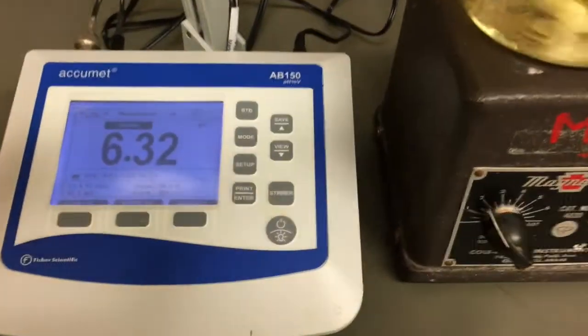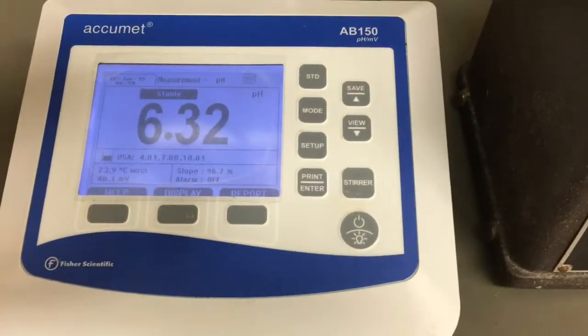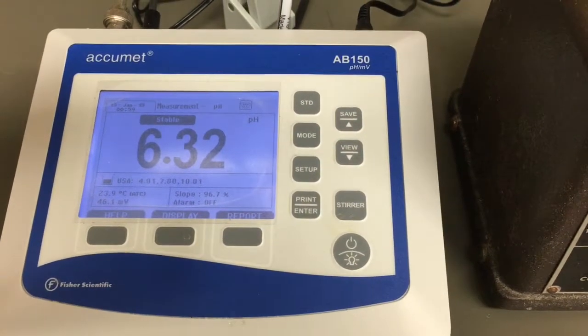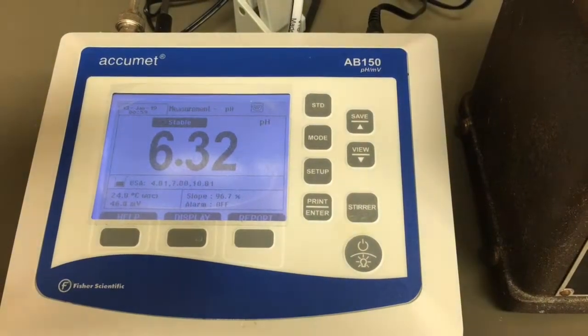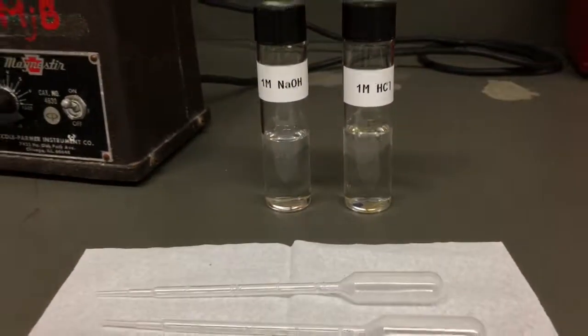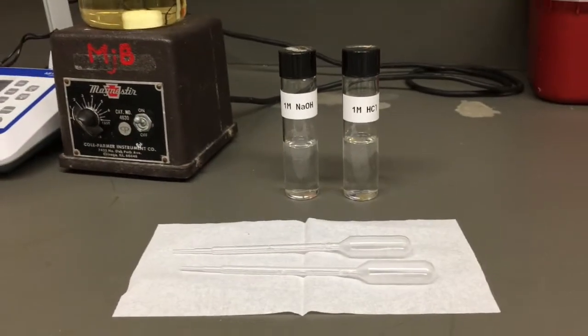We wish to adjust the pH of our solution to a pH of 7 within 0.02 units. As the pH is within 1 unit, we will use a 1 molar sodium hydroxide solution to carefully increase the pH. For larger differences, higher concentrations such as 5 molar can be used to speed up the process.